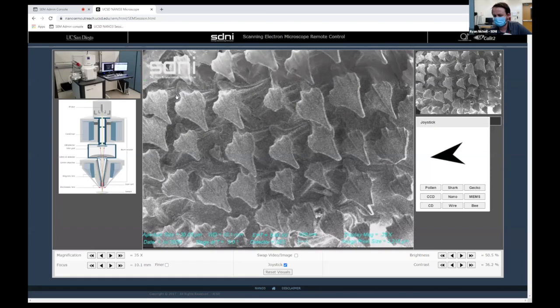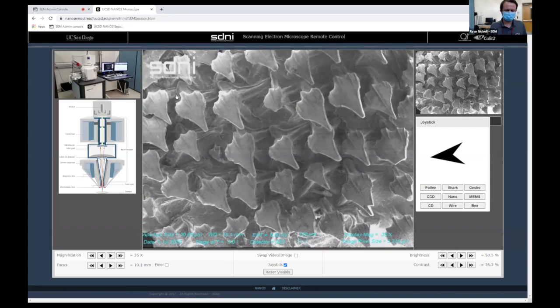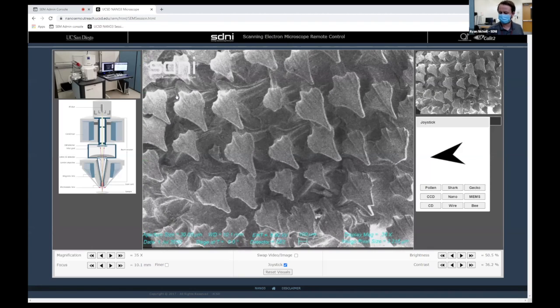You'll start to see it come through in more detail. Yeah. So an electron microscope, it's basically a souped up microscope. It uses electrons, but it's used in almost every conceivable discipline, not only from the very academic chemistry, physics, biology perspective, but also more industrial vocational type of studies like mechanical engineering and those types of industries. Even textile industries use this.